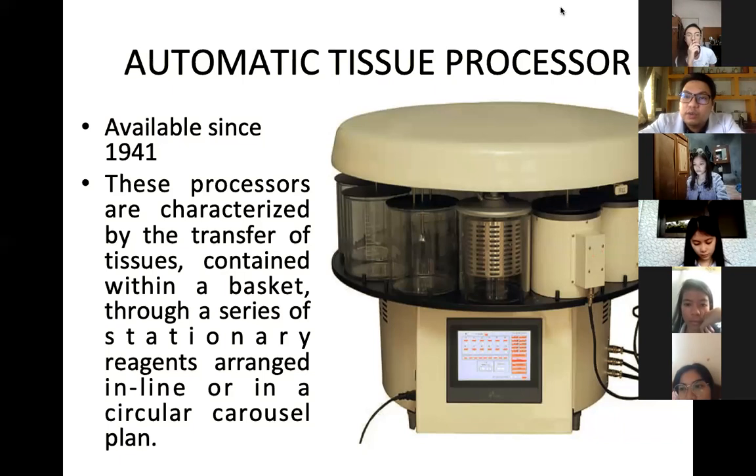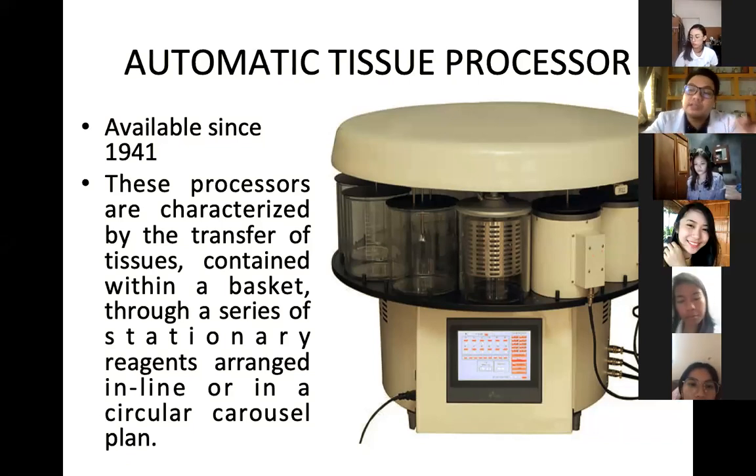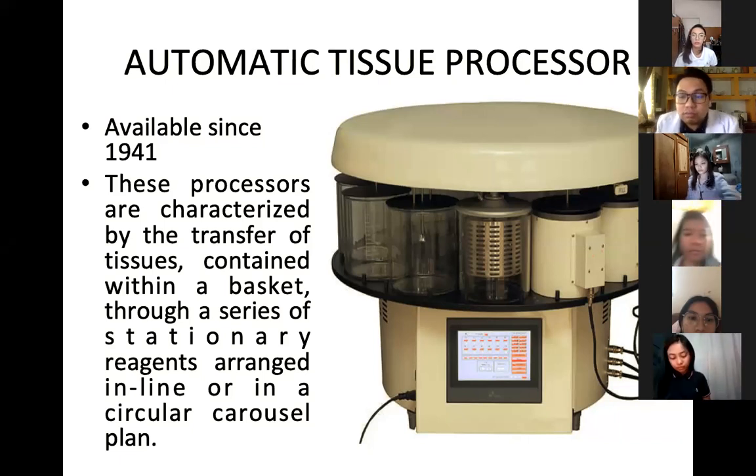If you have watched the video, class, makikita ninyo doon na manually piniperform or tinatransfer ng medtech yung specimen from one container to another. But with Histotechnicon or Auto-Technicon, hindi na kailangan yon. Okay? Diretso na siya. So, computerized the transfer, ano na lang gagawin ng medtech? Maglalagay ng specimen. Okay?